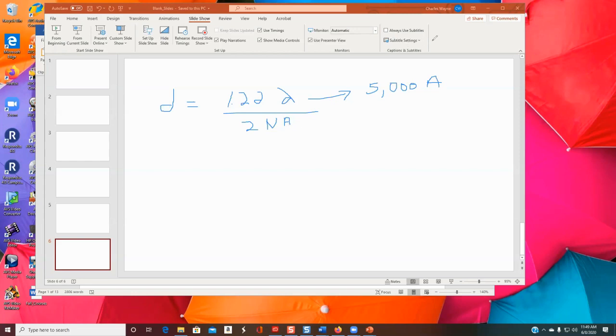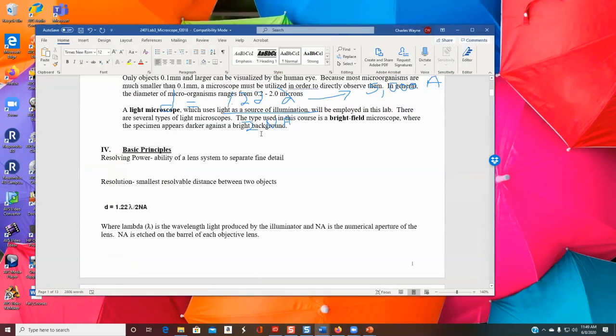So we've got to go back to the microscope for just a moment. I'm going to clear it.